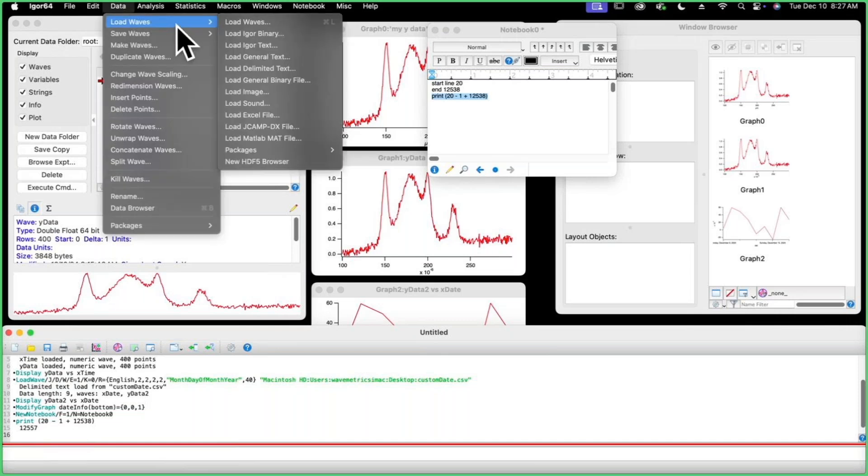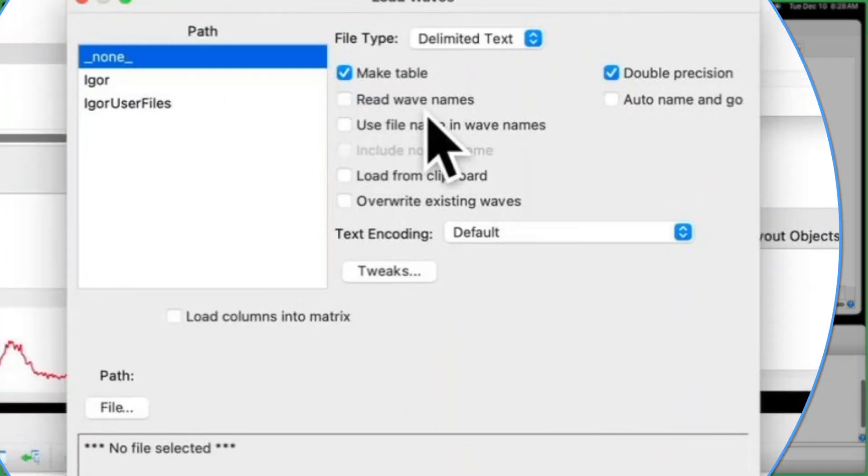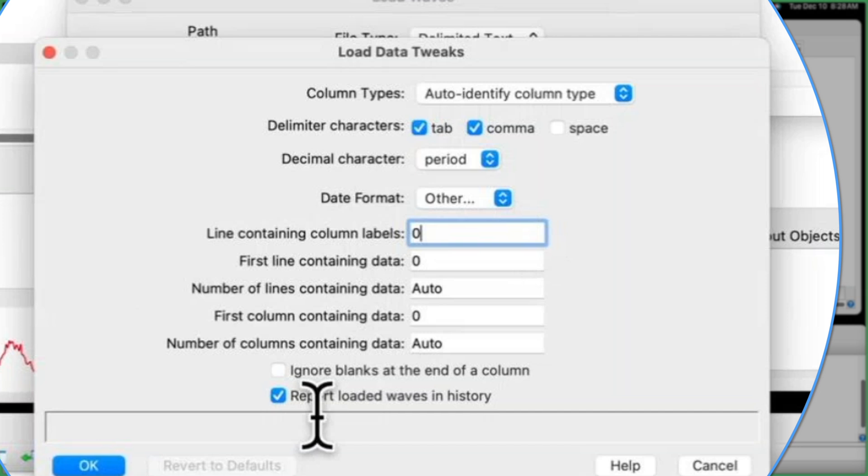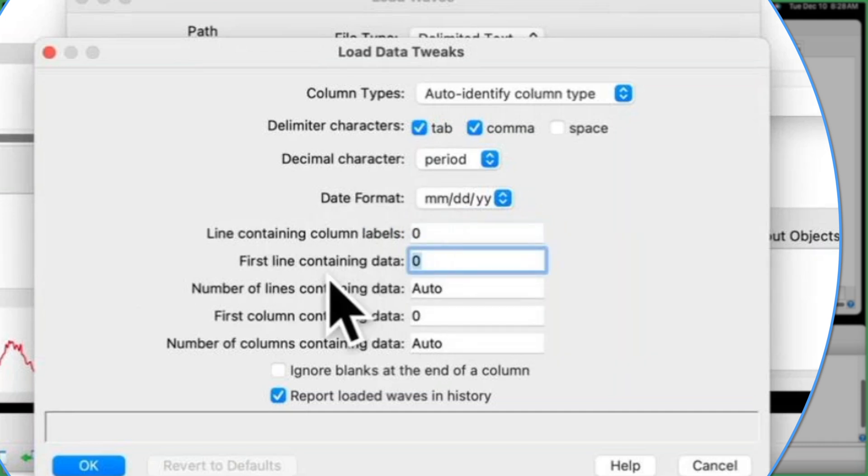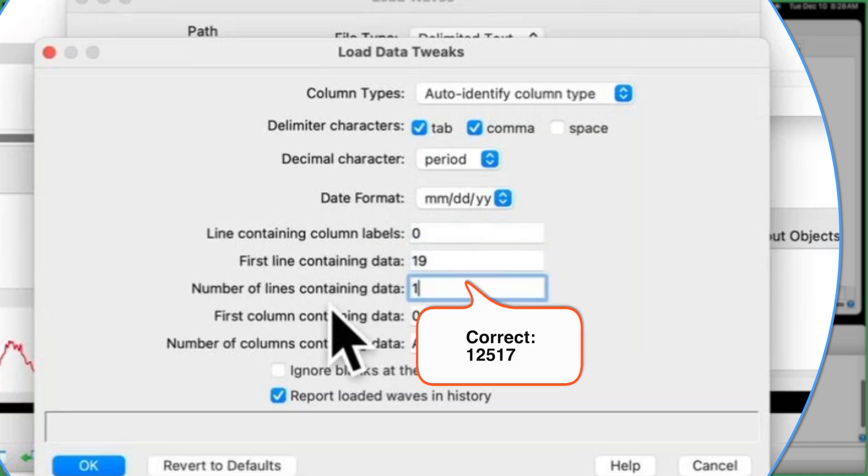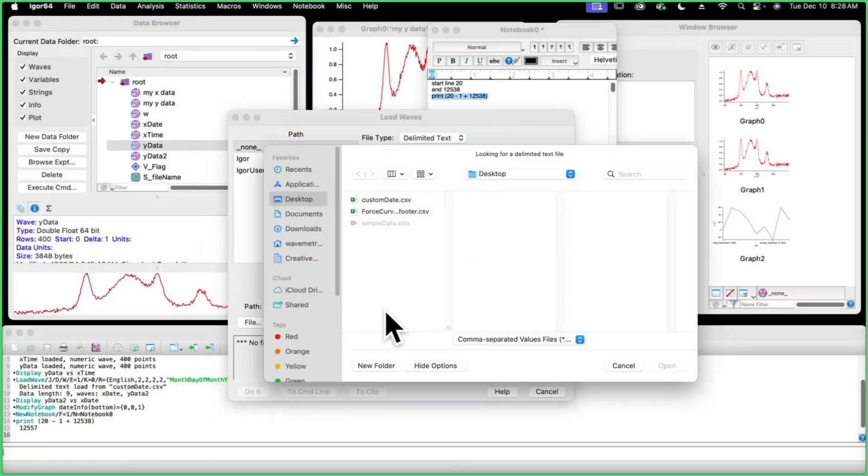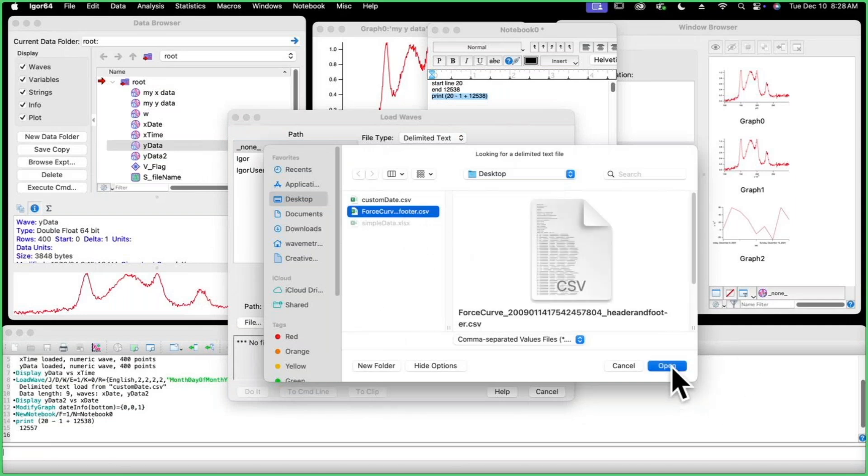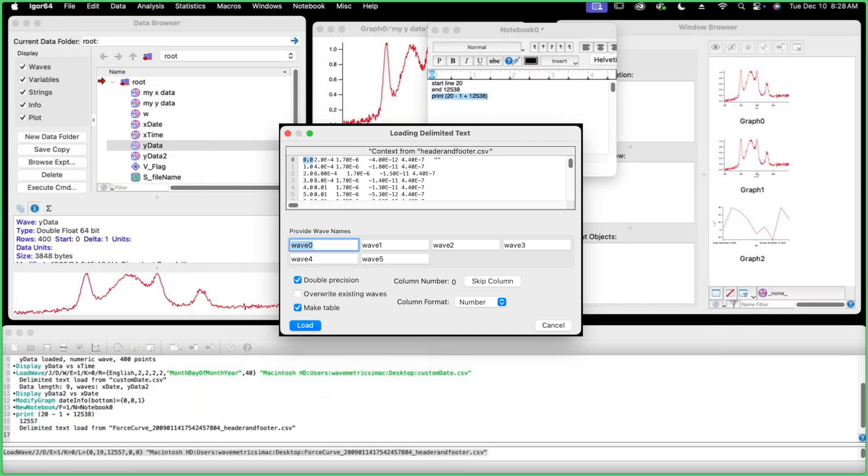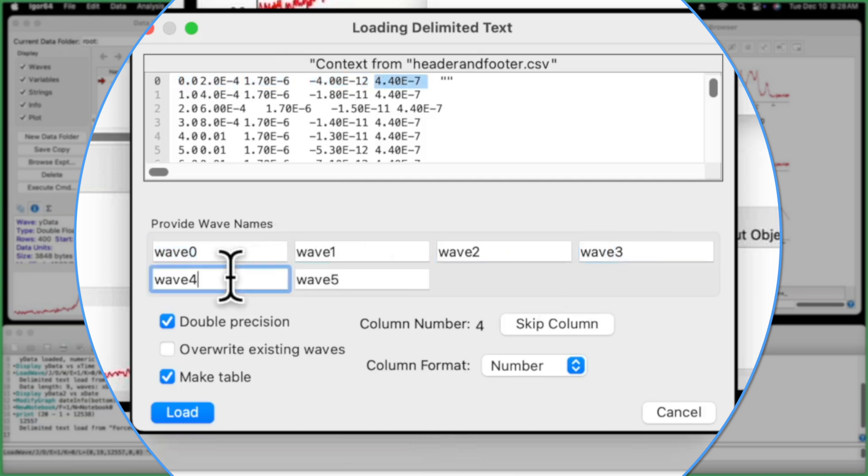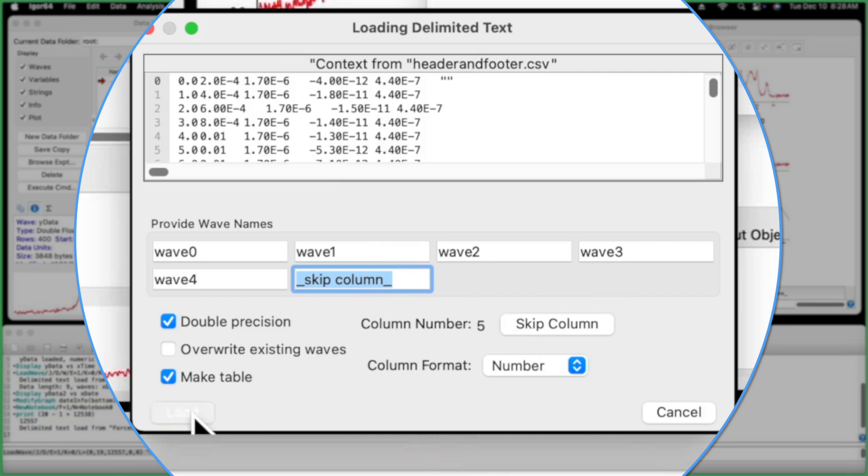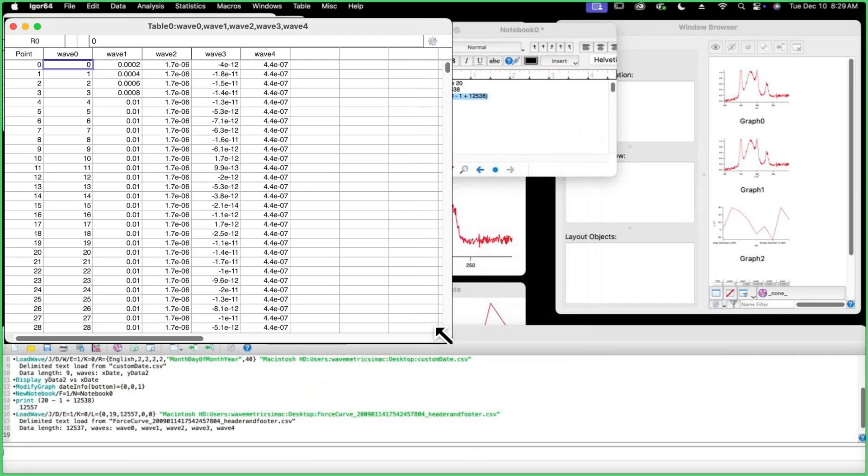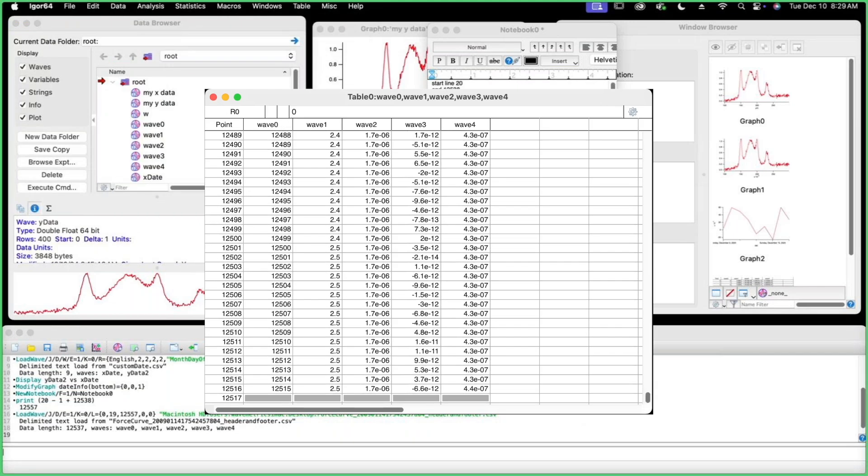I'm going to go to load waves, load waves. This one doesn't have wave names in it, so I'm going to uncheck that and go to tweaks. I'm going to go back to just the default date format, though it's not important in this time. Line containing column labels is none for this example. Our first line containing data is going to be line 19, and the number of lines containing data is 12557. We're going to click OK. We're going to pick our file, which is this one here, and we're going to see how it did. So we have wave zero, that looks good. Wave one, two, three, four. It thinks there is a five because there are some extra spaces, but there isn't. So we're going to skip that column and load. Here we have our data, and it goes all the way to the bottom without any of the header or footer information, and so that's my demo.